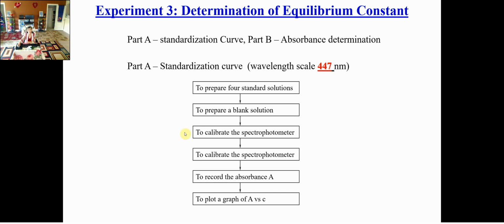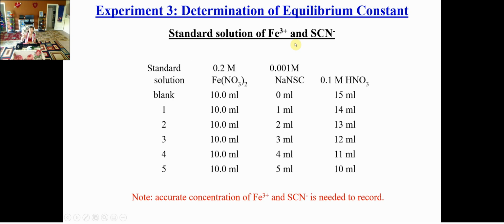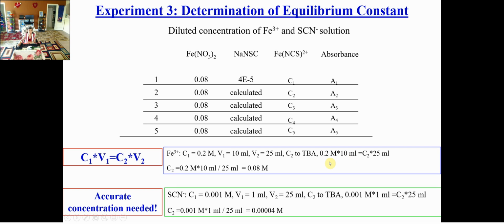Second, you are going to measure the absorbance of different concentrations of your solution. After the reaction, you no longer know your concentration. You prepare your solutions, and from these different solutions you can measure A. Imagine you prepare 5 different solutions and then measure 5 A's.